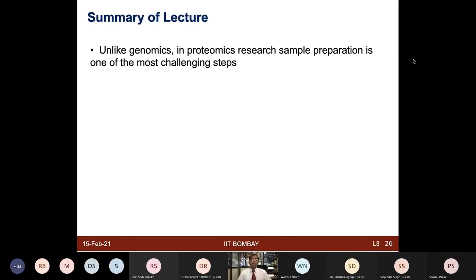So just to summarize my 2 lectures. Essentially, many people have done genomics in different labs at different education levels by doing DNA extraction, doing PCR, and doing basic molecular biology. And people actually expect the same from proteomics as well. And that's why many times they feel like a facility or somebody else as a collaborator has not done a great job for their proteomics project.